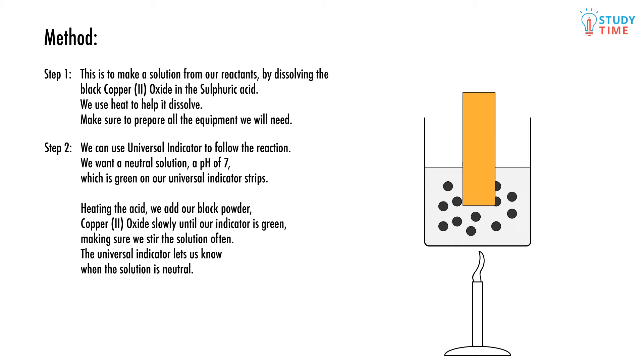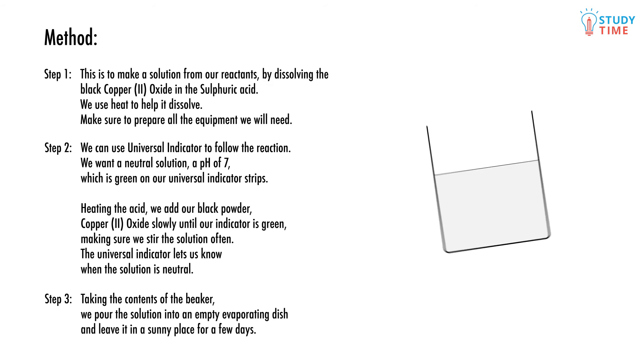Heating the acid, we add our black powder copper (II) oxide slowly until our indicator is green, making sure we stir the solution often. The universal indicator lets us know when the solution is neutral.